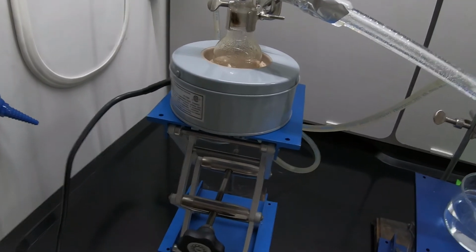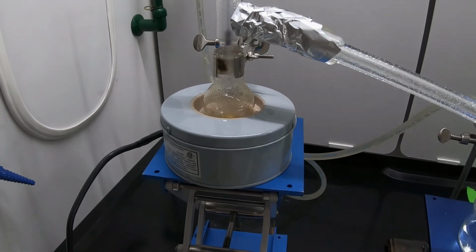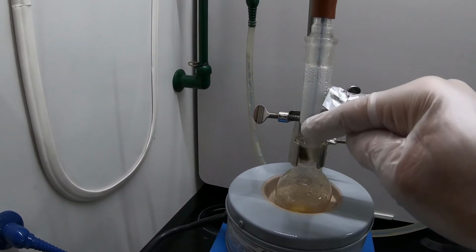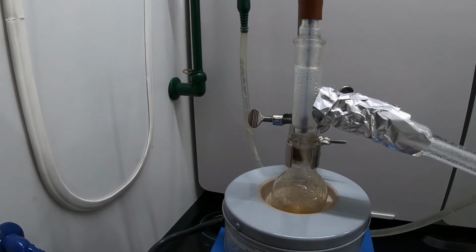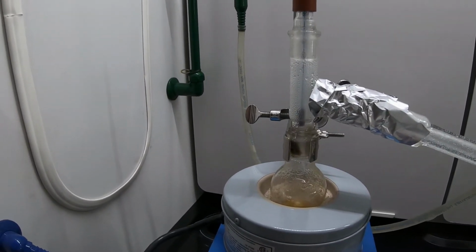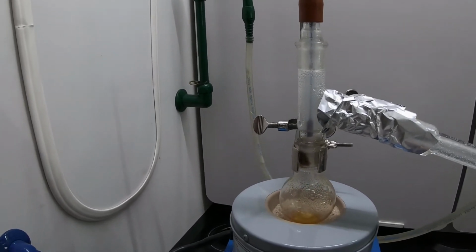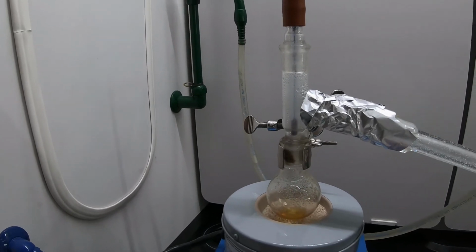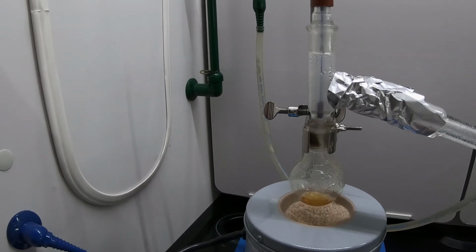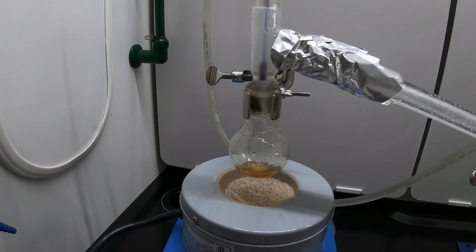And what we have happening in the bottom of the reaction vessel is polymerization, and heavier, less volatile compounds being formed. What's happening is we just simply don't have sufficient vapor coming up, condensing, and keeping the thermometer hot. So this is a very good indication that the distillation has decreased or started to slow down. So I have turned off the variable transformer, and I am dropping the heat source away, and maybe you can see that orange color that I'm talking about.